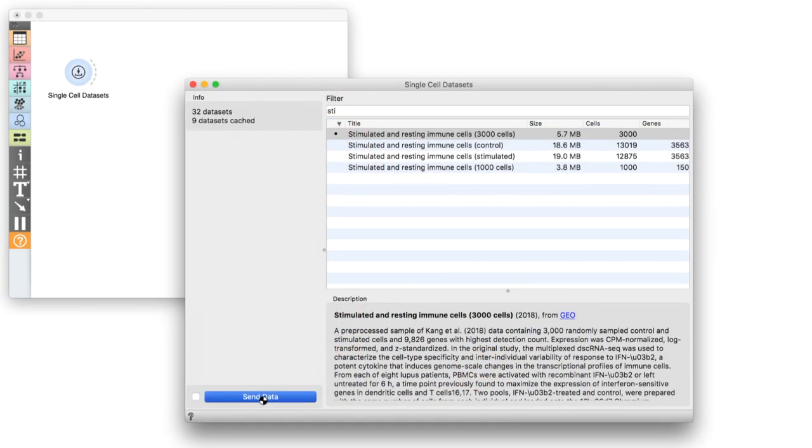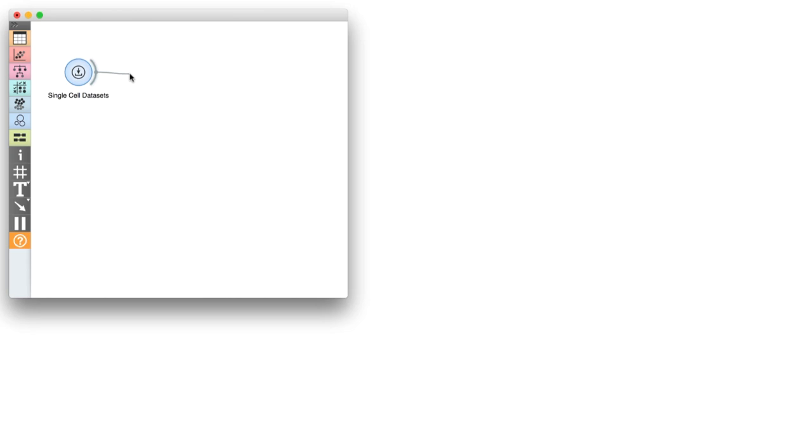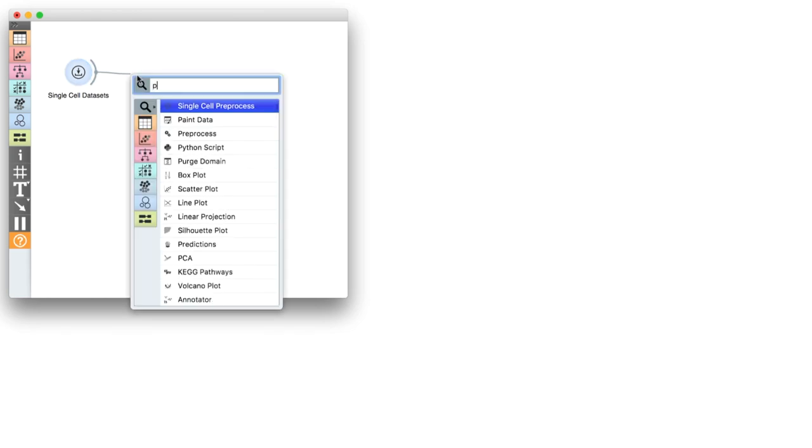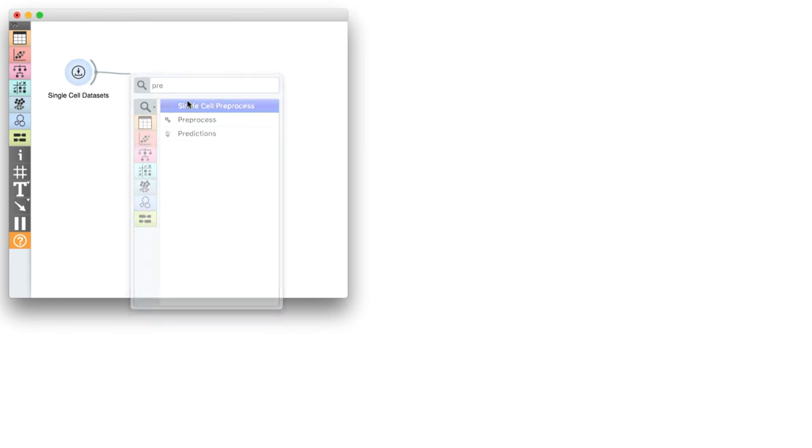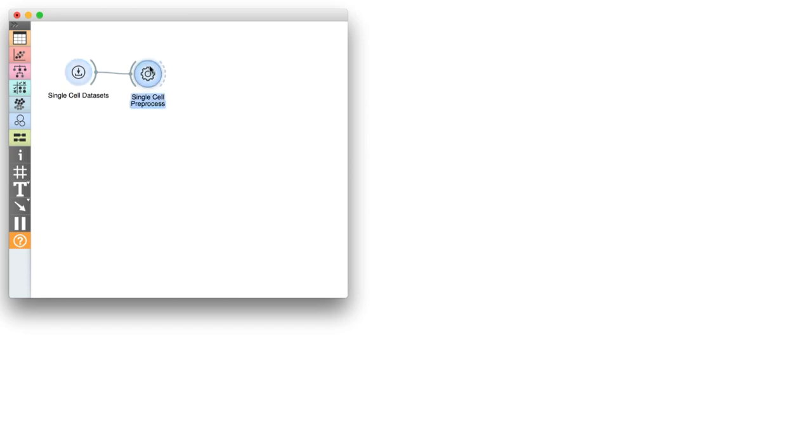We will use a data set on immune system cells in human bone marrow. The 3,000 cells come from two experiments: control or resting cells, and those treated with interferon to induce an immune response.